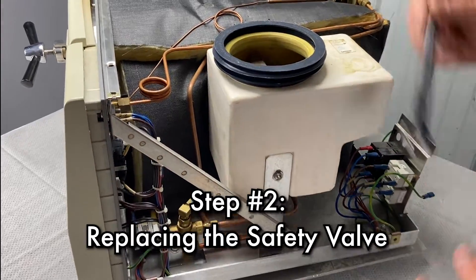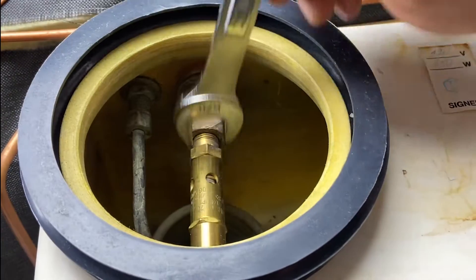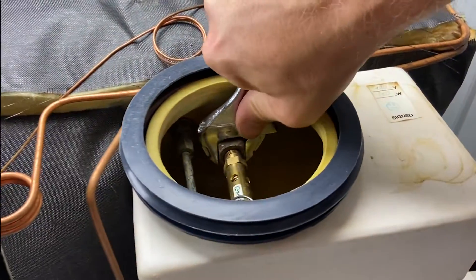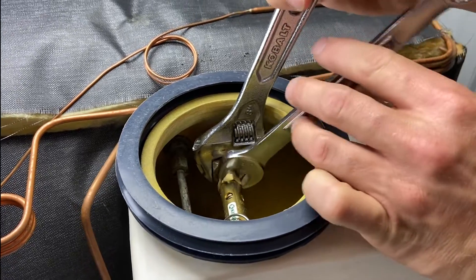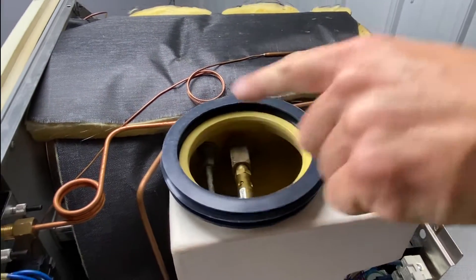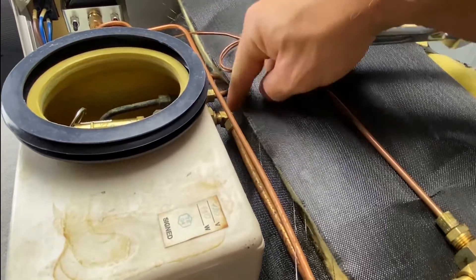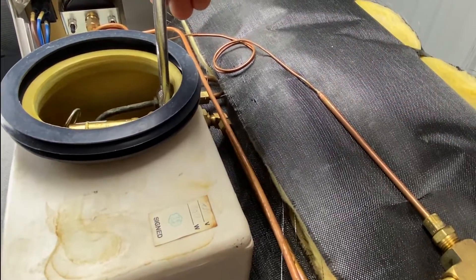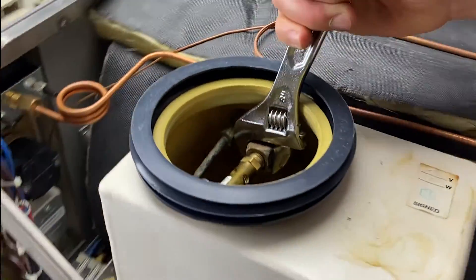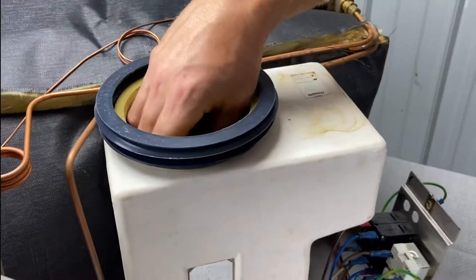Now we're going to replace the safety valve. There are a couple of different sizes — you might need a 3/4 wrench or 11/16. This one is a 5/8. You're going to want to put some counter pressure on this first — hold this fitting in place and then turn the safety valve and spin it off. If you try to just loosen it from the safety valve itself, you might actually torque the fittings in the back. It'll move that whole thing, which can cause leaks and more problems. So hold that counter pressure and unscrew it, then get the new one hand tight.